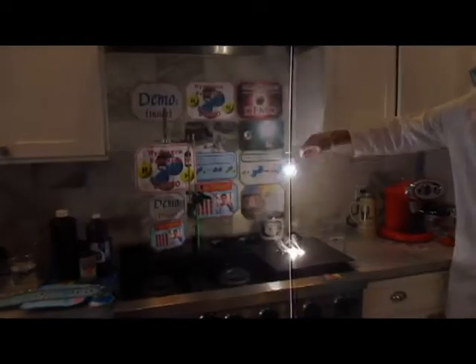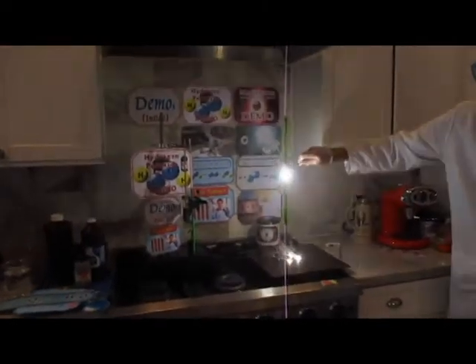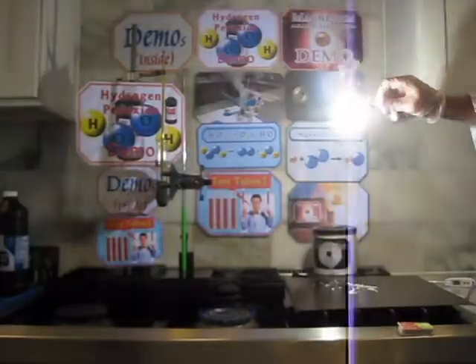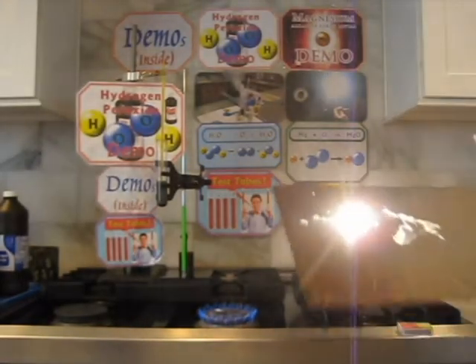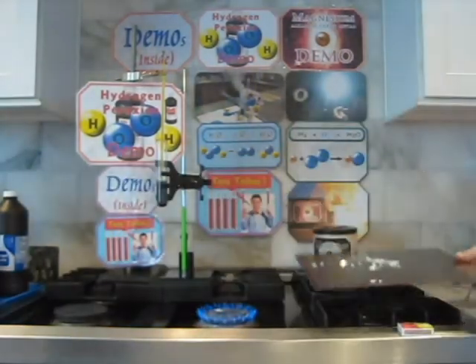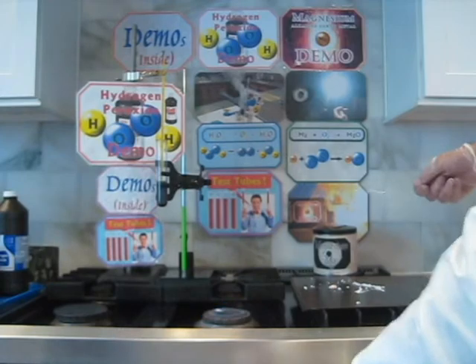Okay, I'm going to have to turn on the expeller fan. It's burning brightly, maybe because of that extra oxygen that is here. This one's going for a long time, a really long time, right? Okay, that is a great reaction, a great example of an alkaline earth metal demo. Let me shut off the stovetop.